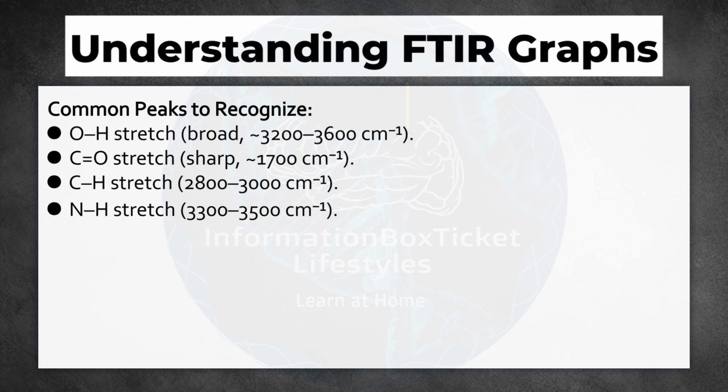NH stretch, 3,300 to 3,500 cm⁻¹. CO stretch, approximately 1,000 to 1,300 cm⁻¹.